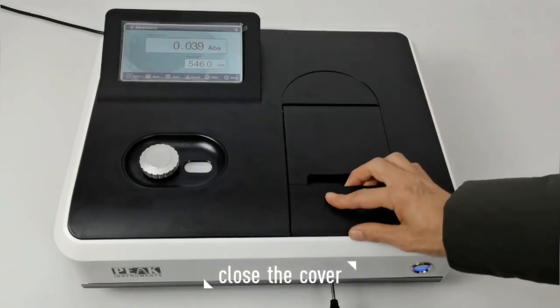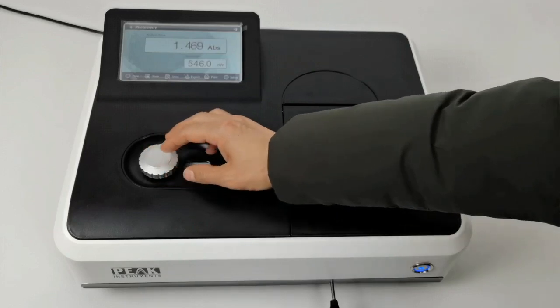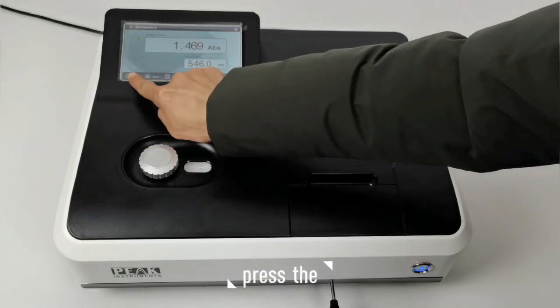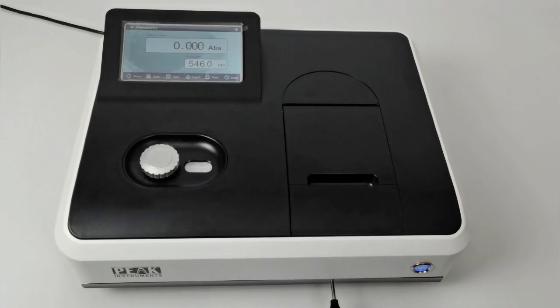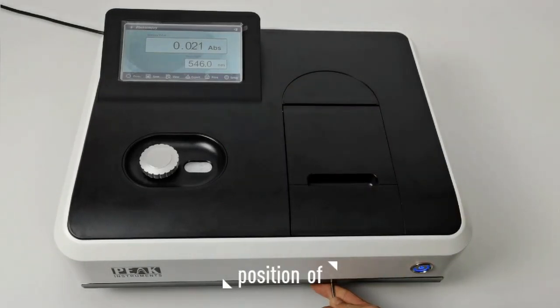Close the cover and change the wavelength that you want, and then do the blanking. Press the first button, then change the position of the cell holder.